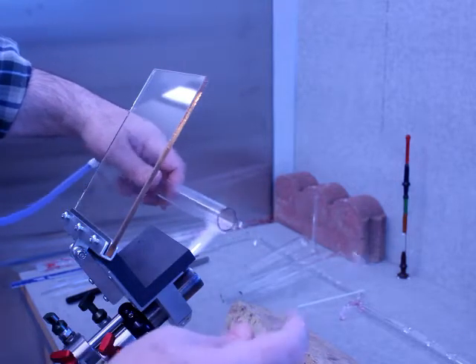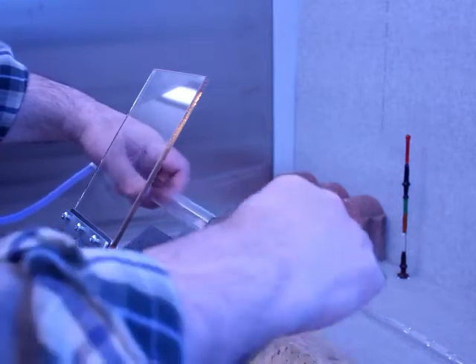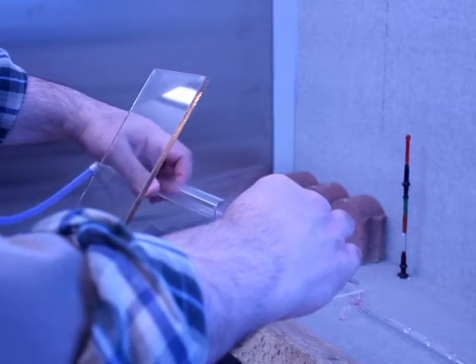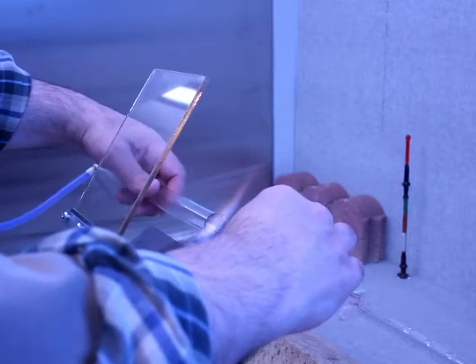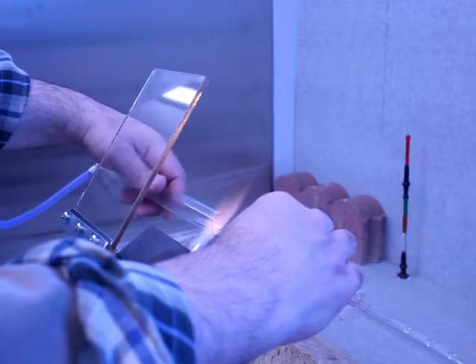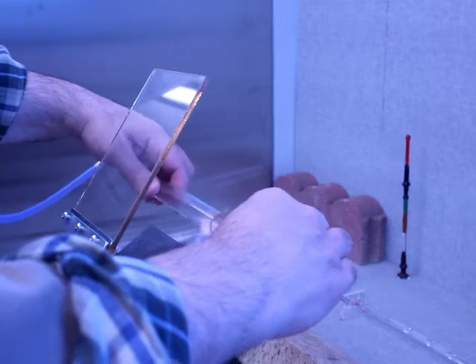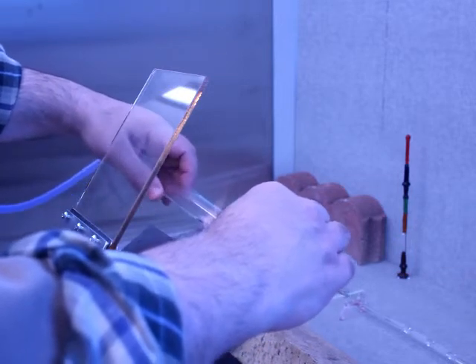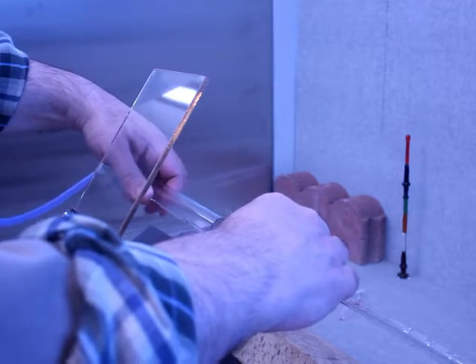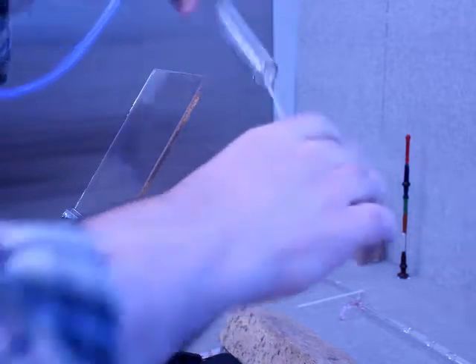But the whole purpose of this is to give me a handle and allow that handle to be centered. Because if the handle isn't centered, you're going to end up with your round bottom off-center, and that's obviously a problem. So in this case, as I'm heating these two together, I do want this effectively to be a hot seal. It could be a cold seal, but I think a hot seal would be better in this situation. I'm going to tighten up this flame.